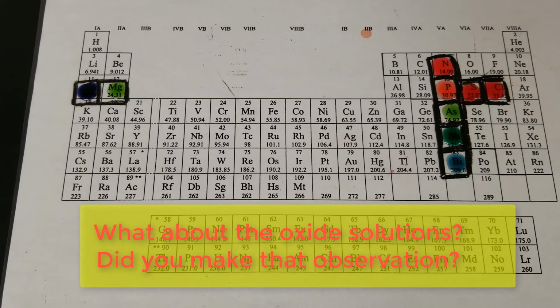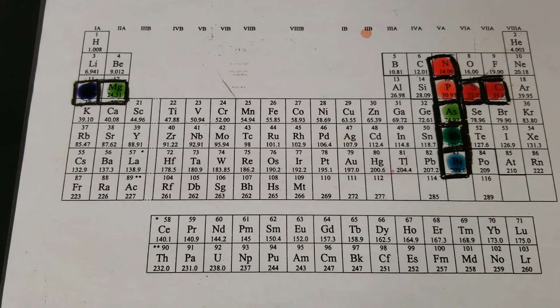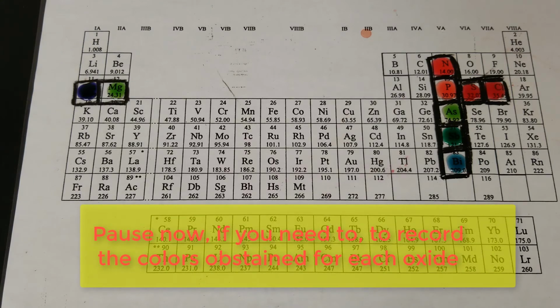What about the oxide solutions? Did you make that observation? Pause now if you need to record the colors obtained for each oxide.